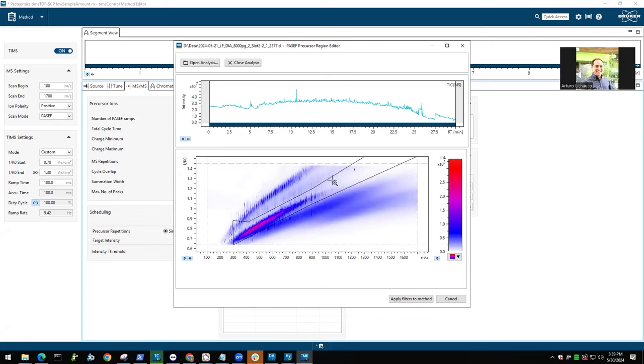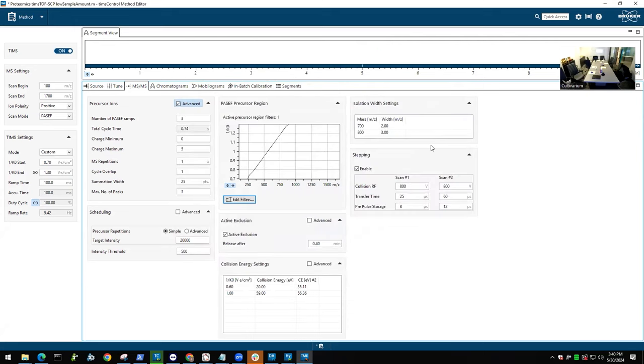Then another way around, if you want to focus on maybe some cryptic peptide, for example, and you see that you identify quite a few singly charged molecules, you could actually include this range. Those would give you peptides with lengths of roughly 7 amino acids, and you manage to include those as well, but still get rid of those singly charged ones, which won't give you any meaningful identification. That's basically just your background. It doesn't really matter if it's DDA or DIA.